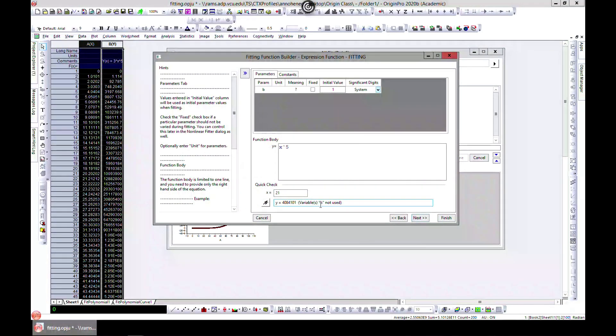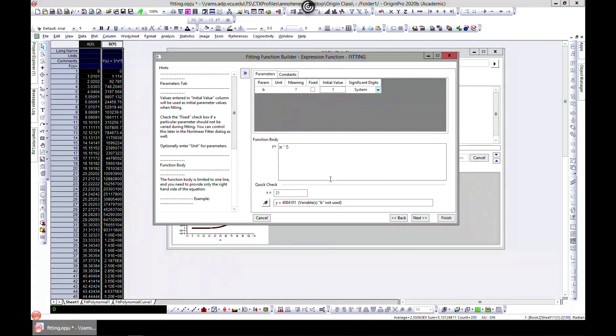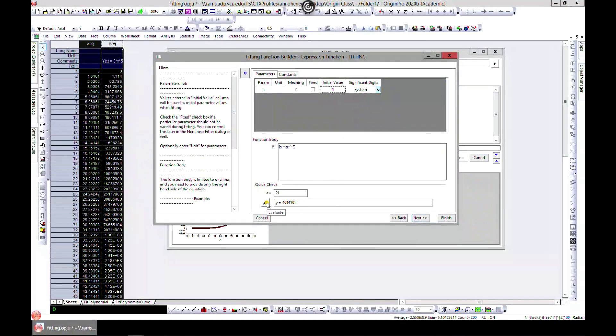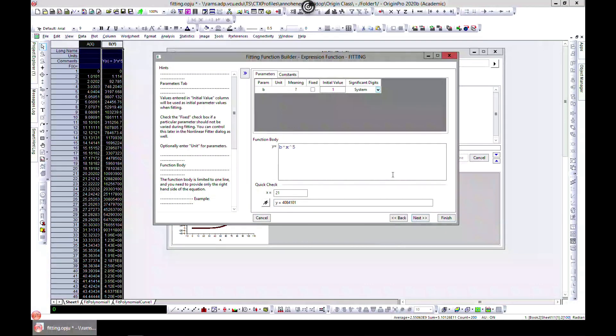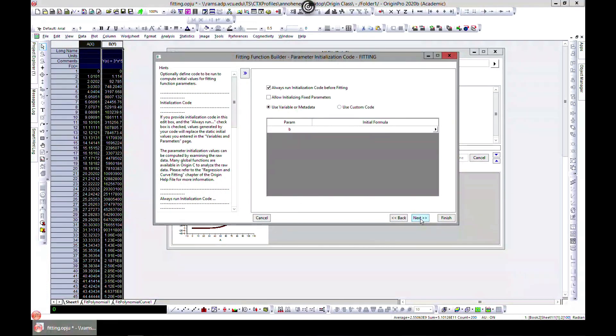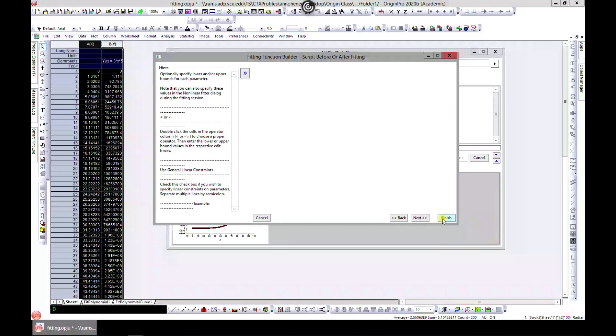From here you can go to Next and hit Finish. Now we are done.